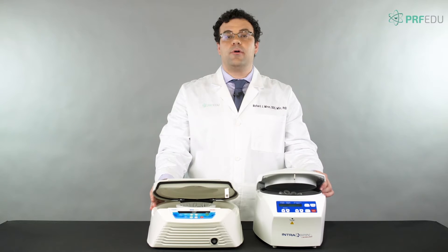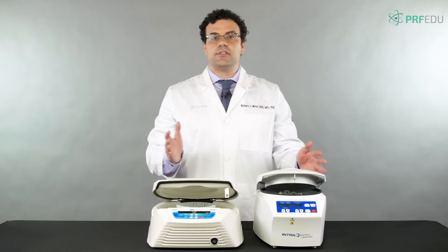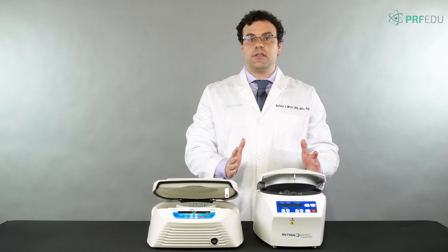In this short demo we're going to talk about the difference between fixed angle and horizontal centrifuges. The first thing you'll notice is that the fixed angle centrifuge is a smaller machine.